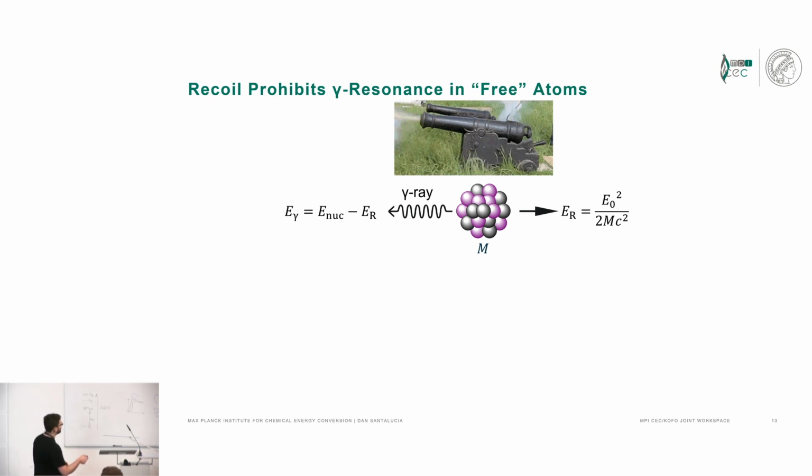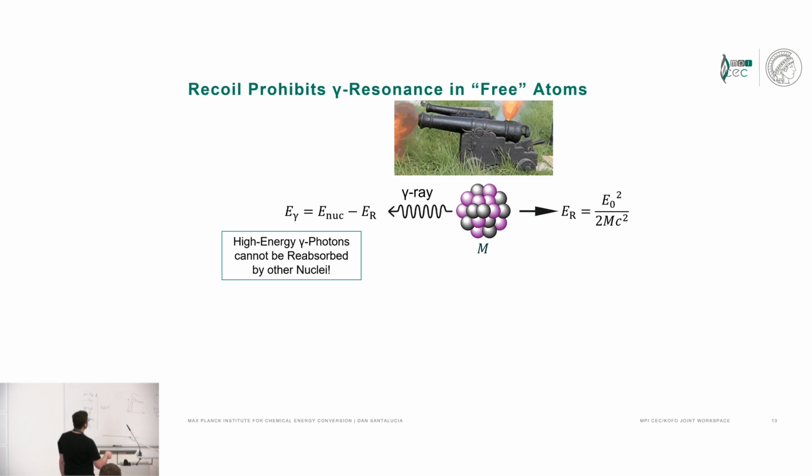It's like firing a cannon, and when that happens, the nucleus actually gains a velocity opposite to the direction of the vector of the gamma photon. So it's recoiling. You can't avoid that. So this is basically a Doppler effect, because the gamma ray energy that's emitted is a function of not just the energy of the gamma ray emission, but also the nuclear motion away from that. And so this ends up being a problem. I'll talk about that on the next slide, I think.